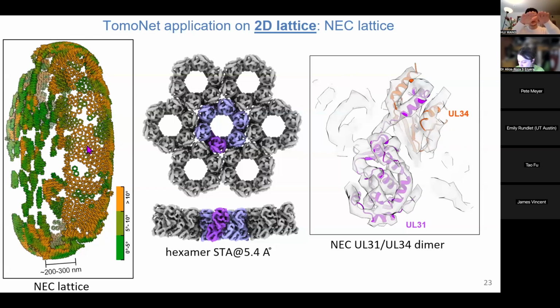as long as you define a good range on each axis, and consider that you need to allow a little bit more angular search, this will accommodate the defects.